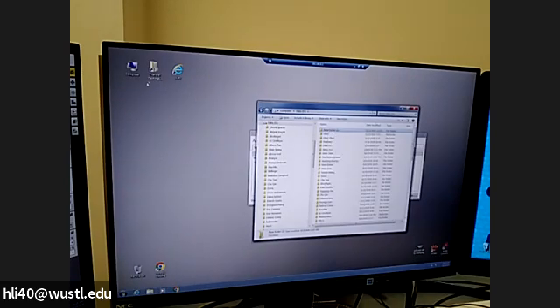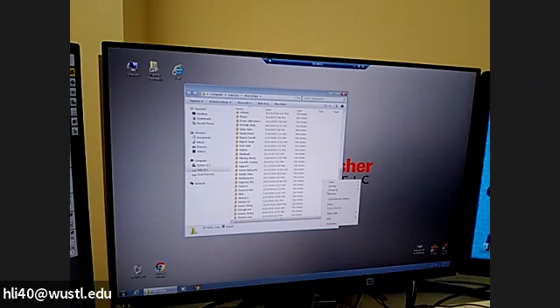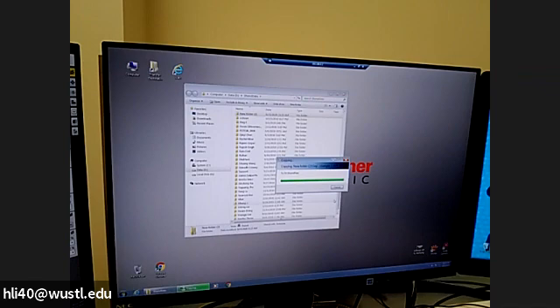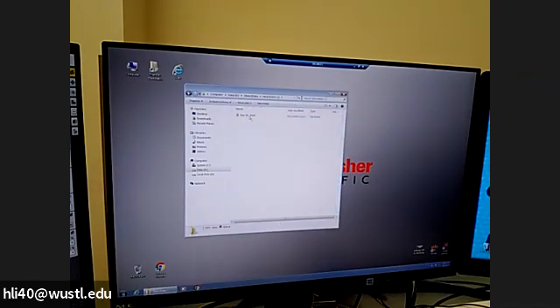And yeah, if you're a first time user, it's good to just copy your name, the whole folder, and then go to transport destination. Okay, and this is share data on this computer. Just right click and paste. Okay, so it's here. So now you can use USB, or you can upload to your web box using this computer. I noticed the internet is not running right at the moment. I don't know why. There are a number of issues with this instrument, which I need to get solved.